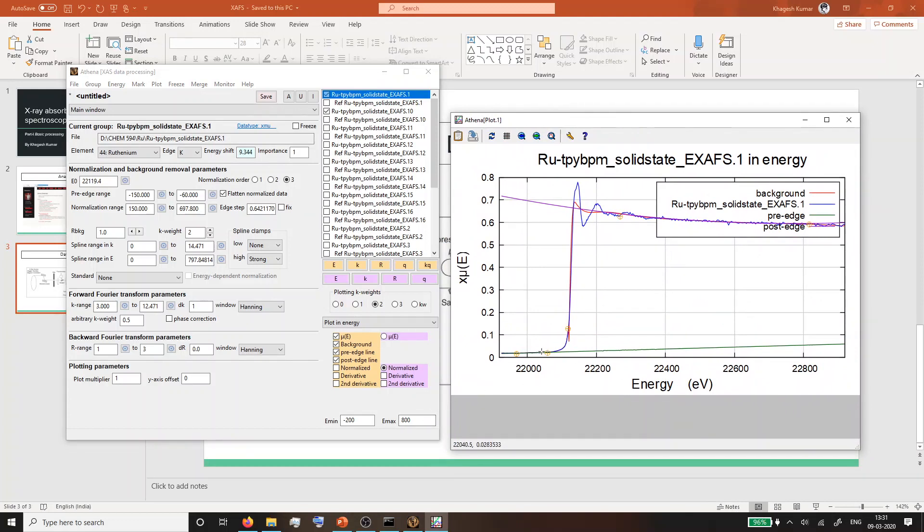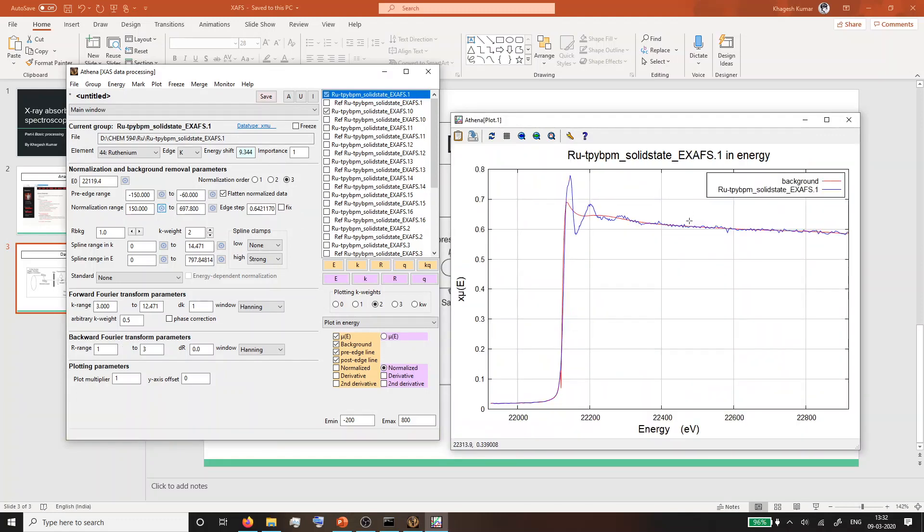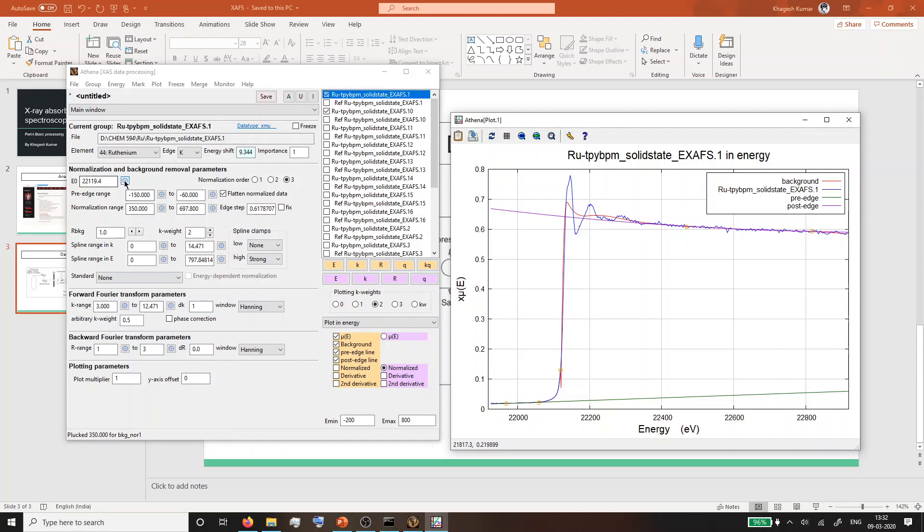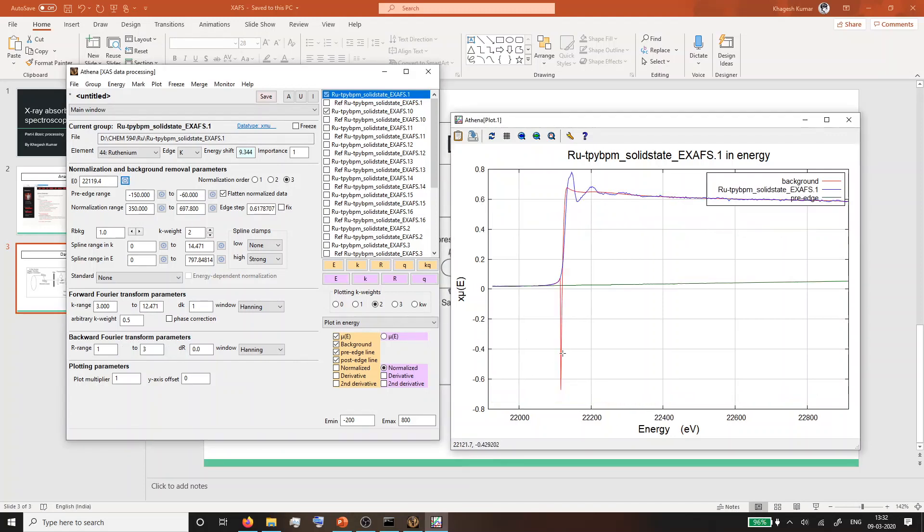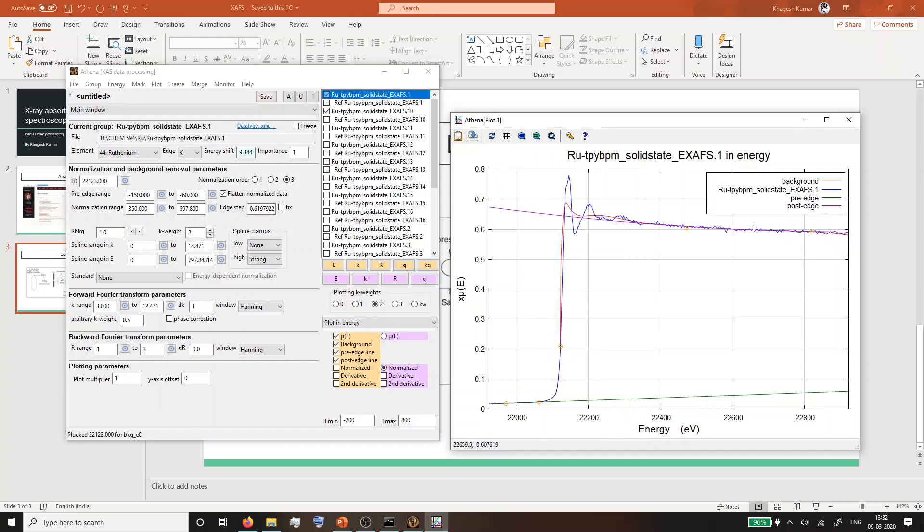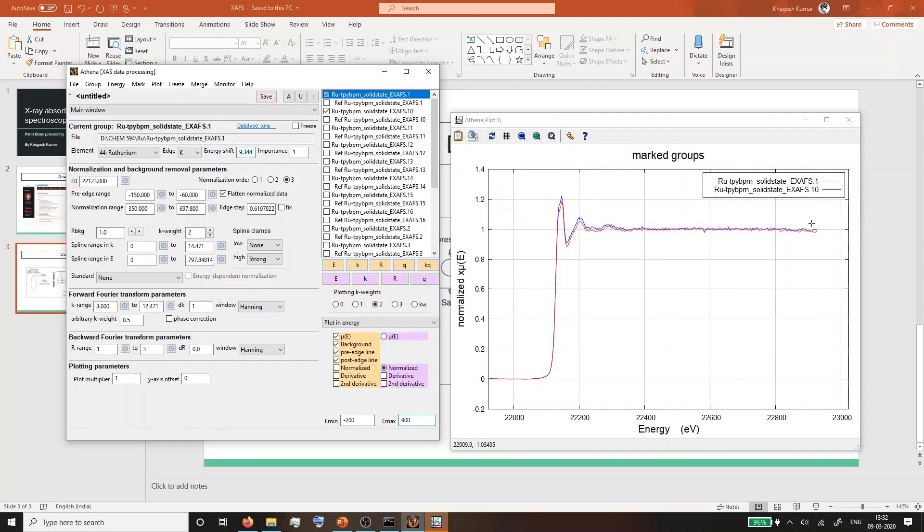The pre-edge looks fine. You can change the post-edge by going to the normalization range and selecting this button. This is a good spectrum. Depending on that, you might have to adjust. If you see the background has a kink like this, it means the E-naught value is not best set. You can go and change this value until it gets to a straight function. This looks better without any kinks. It means the Fourier transform data is looking good. You should look at the whole data at the same time to see if there is any unusual kink that you need to take care of.